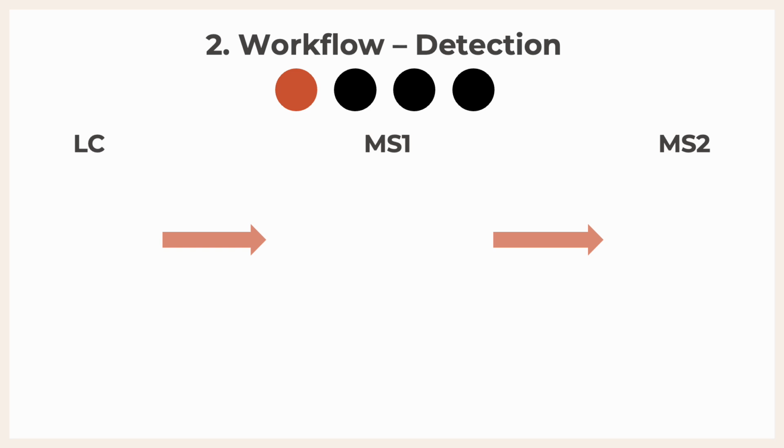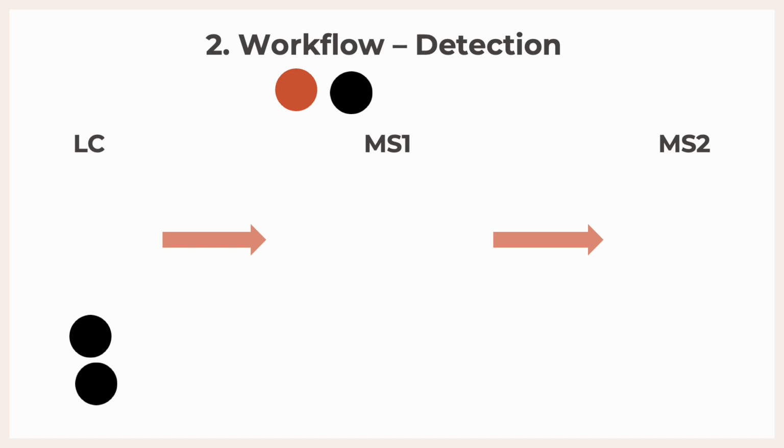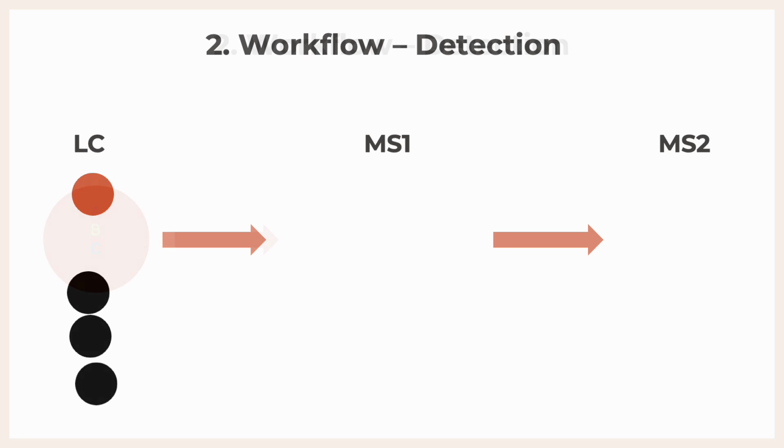We're going to subject it to liquid chromatography. And the black circles are going to separate. That's a funny way to say it, but they're essentially going to break apart from our main analyte, which is the red-orange circle. And now that's the chromatography done. And now we're going to go through mass spec.